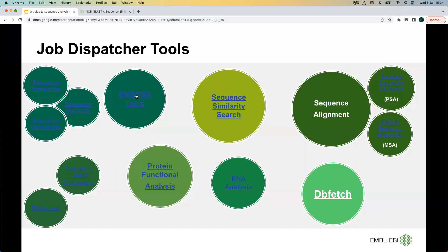Each tool category has a landing page. If you click it, it will lead you to the landing page of that particular tool category, with a list of tools in that category and a brief description.